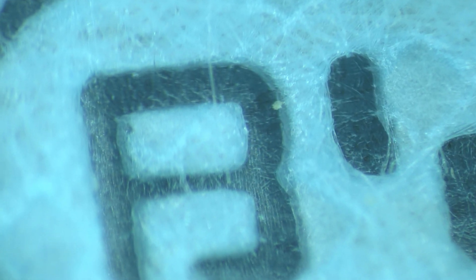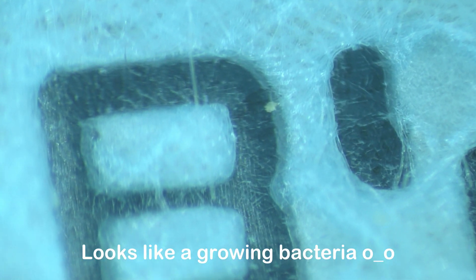And this is actually a brand new mask but look at this, it's already dirty even though it's the outer part of the mask. You know, some yellowish color here. There is something on it there on the letter B.